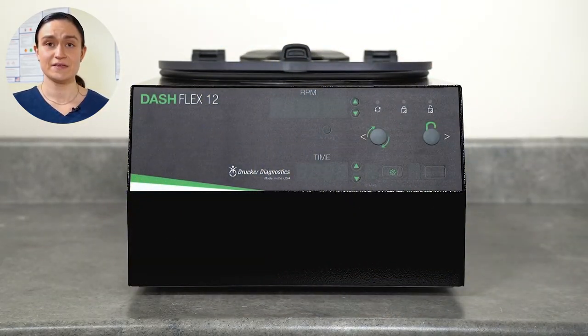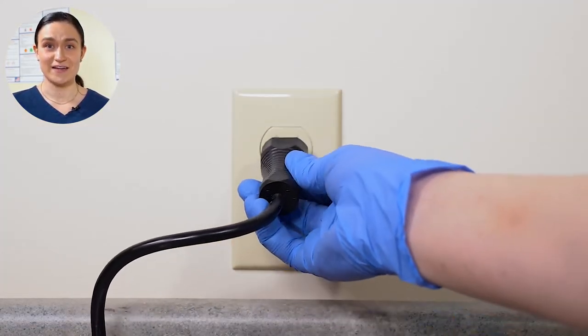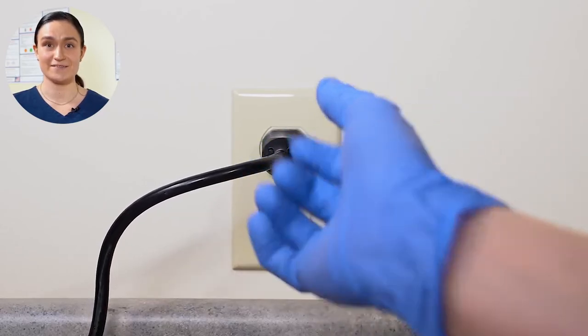Once you've finished cleaning, you can plug your centrifuge back into the wall and turn it on using the power switch at the back of the centrifuge.